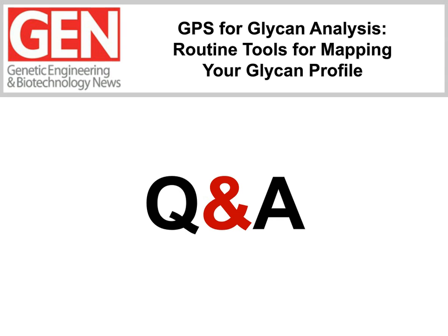In terms of how often it's replaced, it's hard to say because outside of it getting clogged, there's really very little need to change it. So likely at PM is when it would be changed. And the clogging issue really comes down to care and use of the instrument.